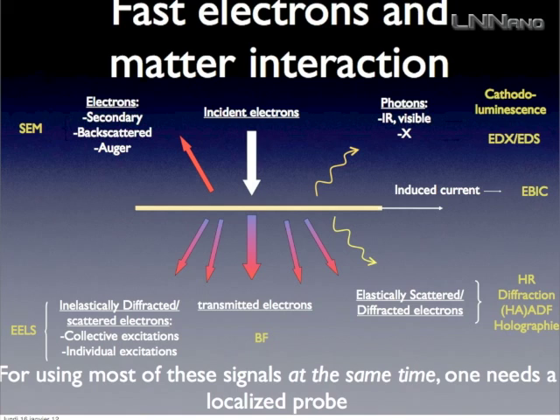If your electron has lost some energy and given this energy to the material, it's most likely that the material will not keep all this energy for itself. So at some point, it will release this energy. A lot of times this energy will be released in the form of phonons, so you cannot really measure them, not today, maybe in 10 years it might be possible, but not today. It can also release energy, if you are lucky, in the form of photons, so light.